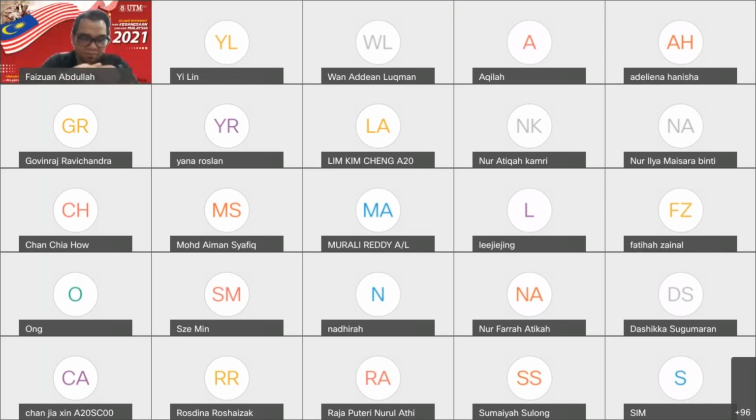from 1000 ppm to 100 ppm, and then from 100 to 10 ppm. And I think from 10 is enough for us to do up to 0.1, 0.2, 0.3, 0.4, 0.5. Okay, calculate.